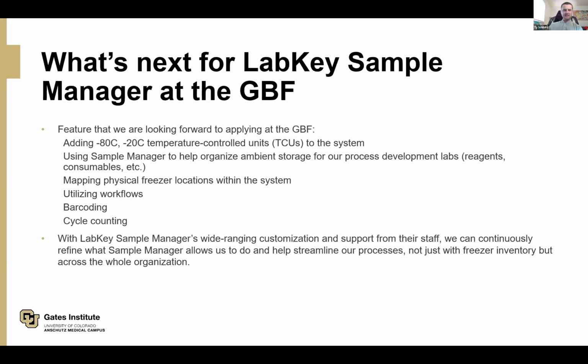We also had our process development lab say, hey, it might be really nice to use this to help us organize the storage that we have downstairs. Because there's a lot of consumables, reagents, and items that move in and out of those labs, and they're not as strictly controlled, they can sometimes have struggles organizing those.